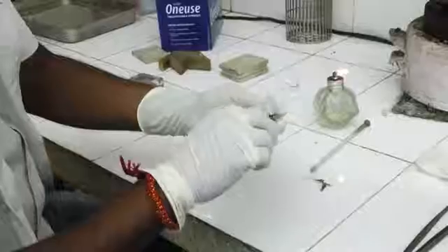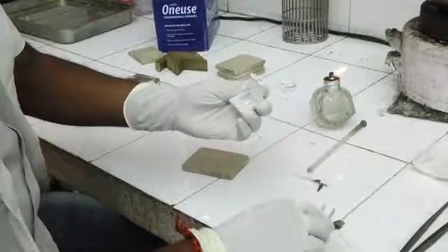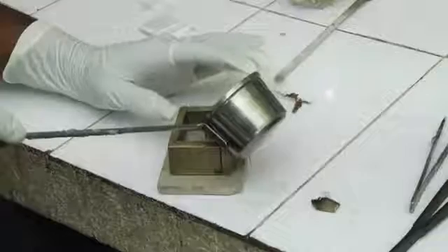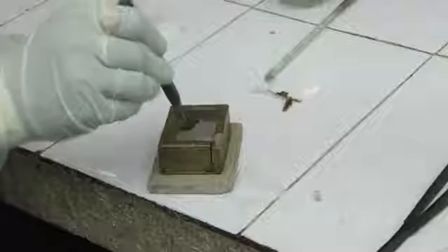Embedding. The impregnated tissue now has to undergo embedding. For embedding the tissue in melted paraffin, metallic molds are used. At first, lubrication of the metallic molds is done by liquid paraffin. After that, melted paraffin is poured in and the tissue is carefully embedded in proper plane at the bottom of the metallic molds.